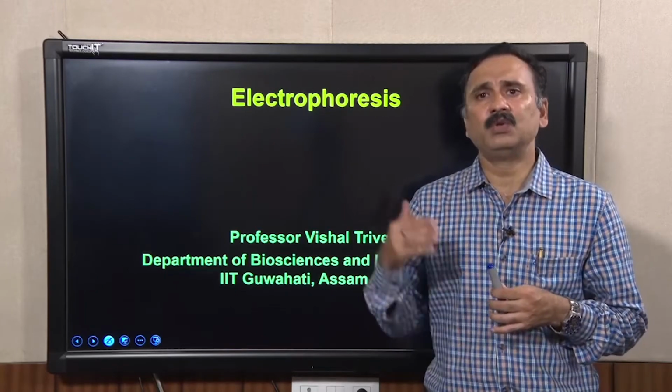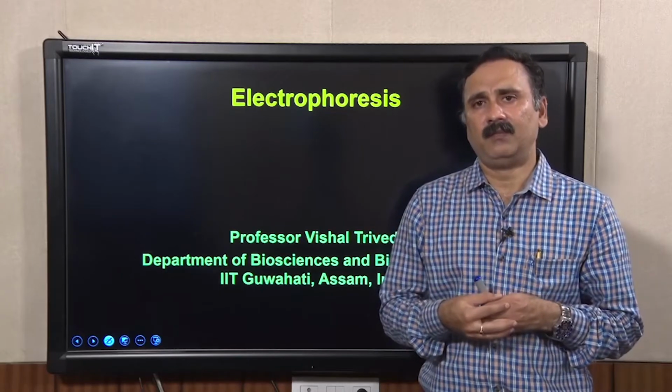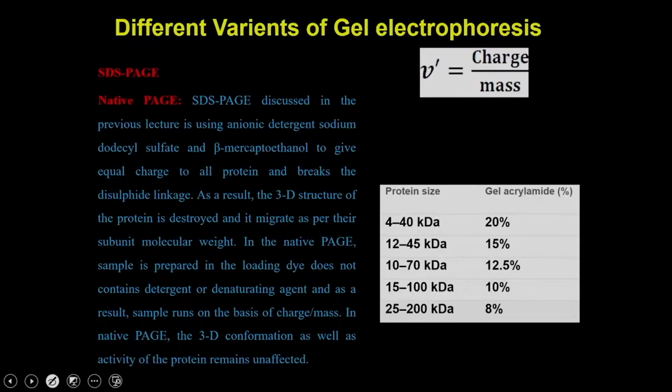So, let us move on to discuss the different variants of gel electrophoresis which are available. There is SDS PAGE, which is actually a denaturing PAGE.